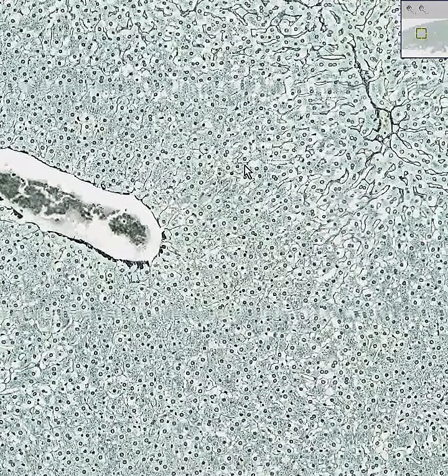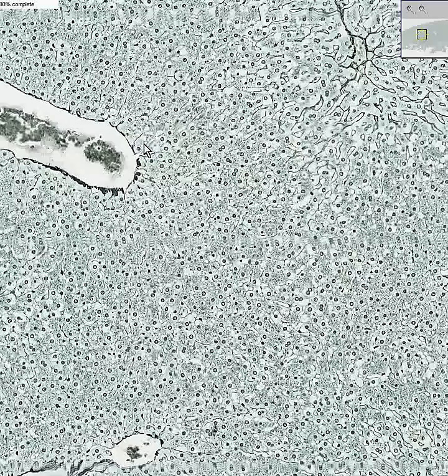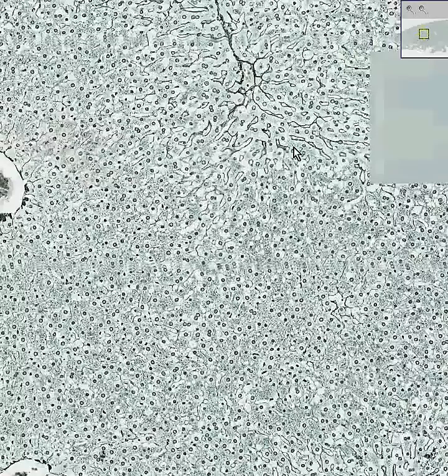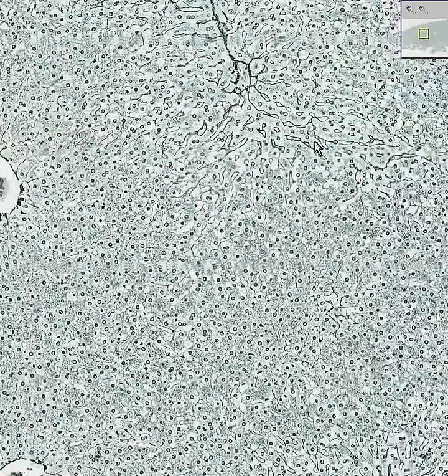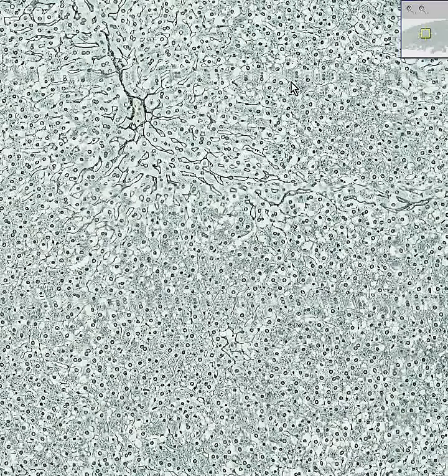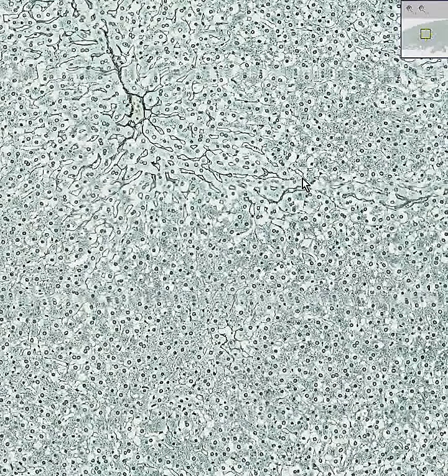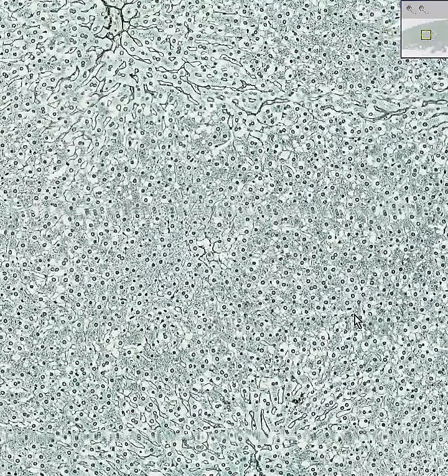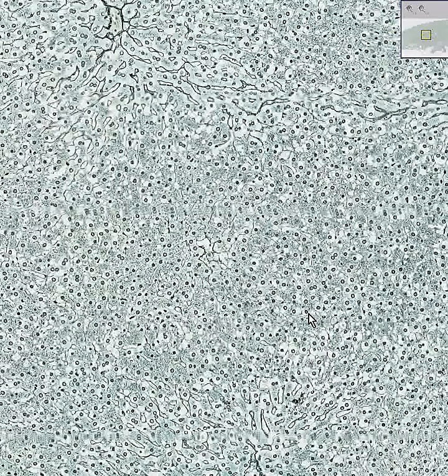So don't ever let anybody tell you that there are no connective tissue fibers in the liver lobules themselves, because here you can see beautiful reticular fibers, and look how the round nuclei of the hepatocytes stand out like a sore thumb.